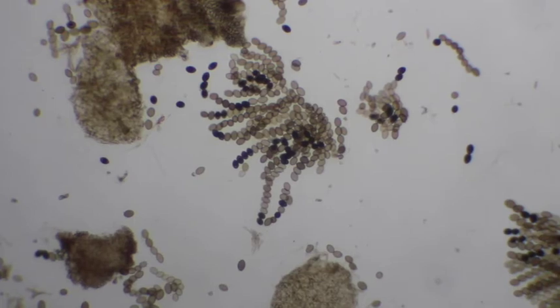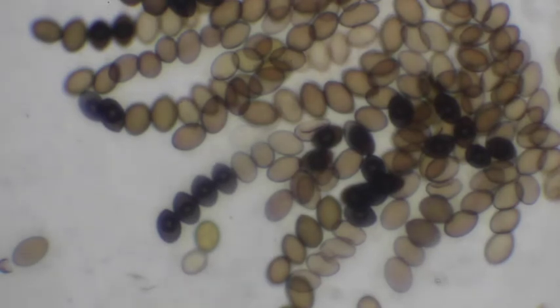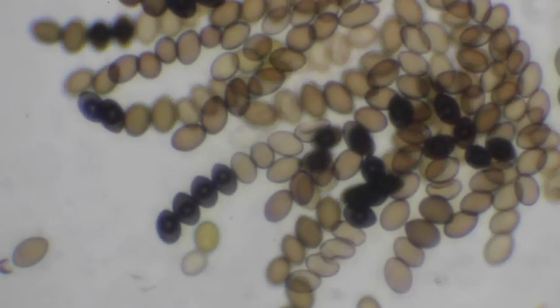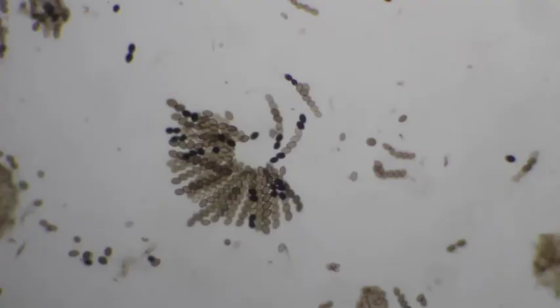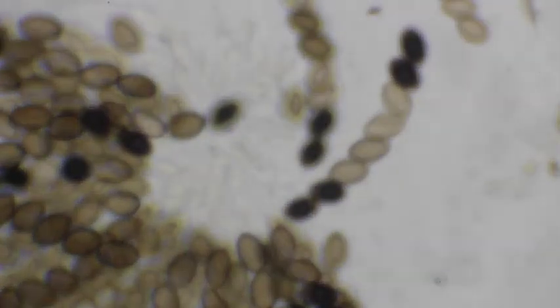Here's a nice one of 8 intact spores. Dead center, we can see that one pretty clearly. That's nice. Okay, in the center of this one, there's a nice one. We can see clearly, ooh, a really nice one.